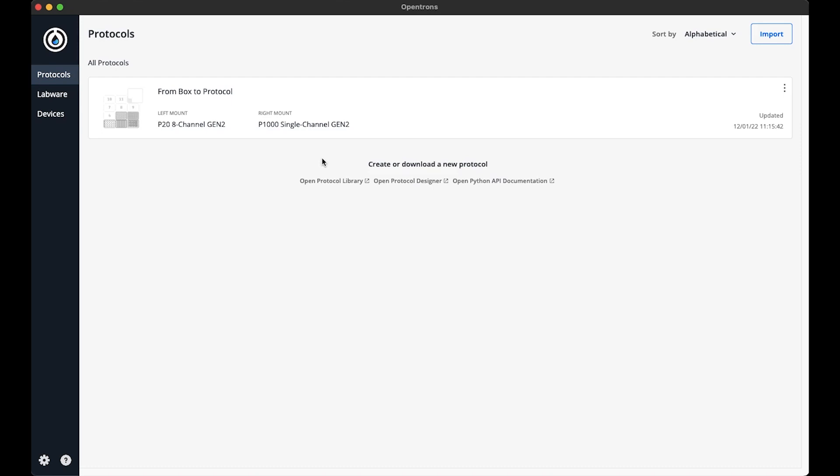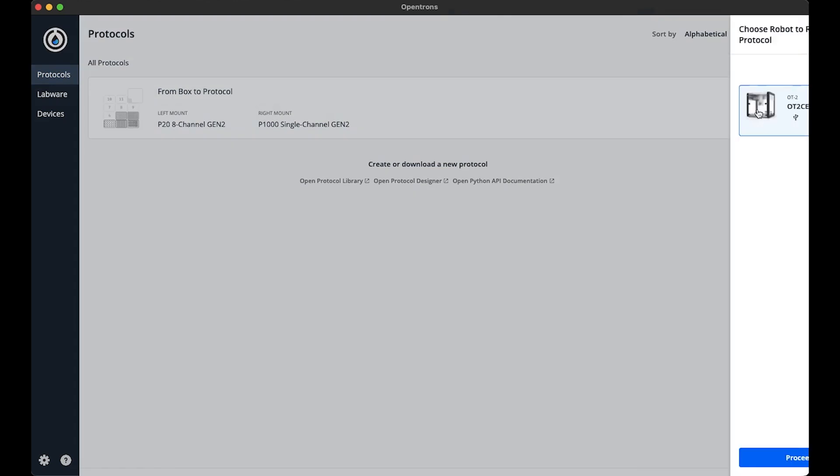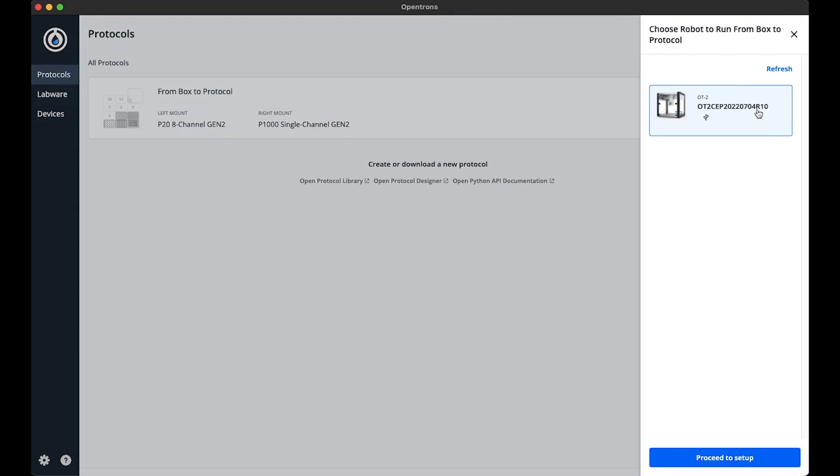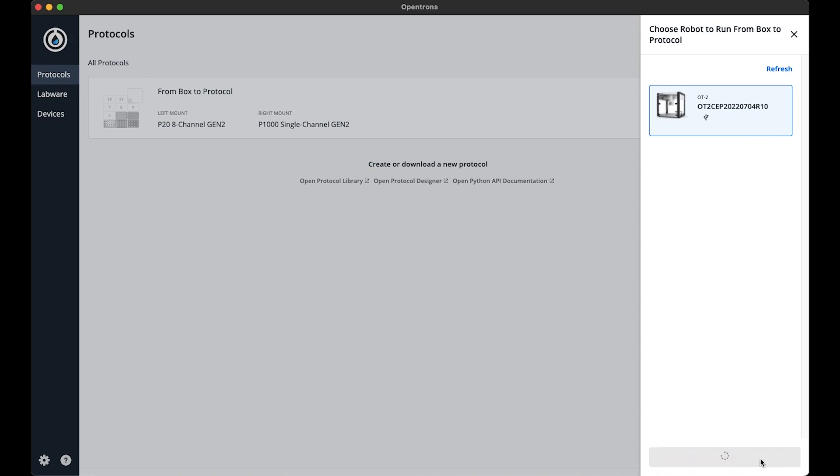Once the protocol is imported, I can initiate the run process. To do this, I will need to be in the protocols tab. Then I can select the three-dot menu, which will display a drop-down menu from which I select the run option. I need to select which OT2 I want to run this protocol on. I only have one OT2 available, so there's only one in this list. If I did have more than one OT2, there would be multiple in this section. I select the robot and click proceed to setup.